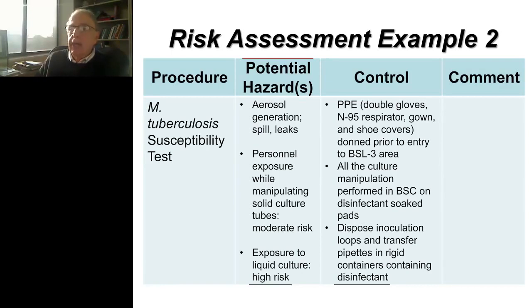So if you get any splash or splatter, it drops on those pads and the disinfectant will kill it. And then you dispose of the inoculating loops and transfer pipettes, etc., in a rigid container containing disinfectant, and you keep that container inside your biosafety cabinet so your hands aren't going in and out with your inoculating loops.